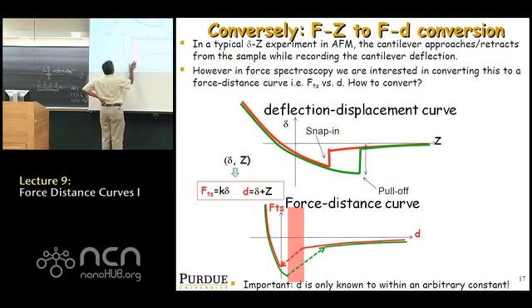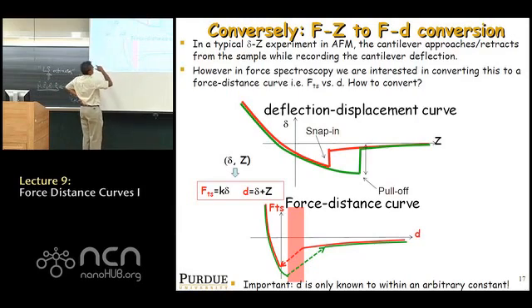By the simple geometry that I told you, what you measure is delta versus Z. Delta is the cantilever deflection versus Z. You convert delta into interaction force by using the cantilever spring constant K, and you convert the measured delta and Z to the tip-sample gap D. So in an AFM experiment, you collect sets of delta comma Z, delta 1, Z1, delta 2, Z2, and for each set you convert it into an F versus D using these two relationships.